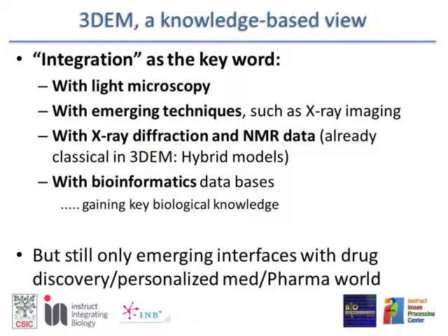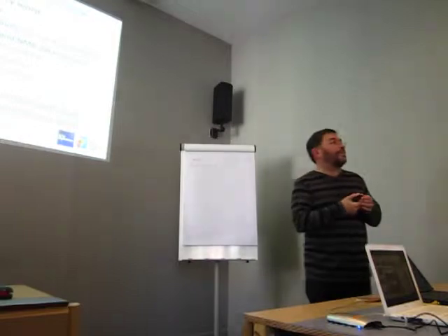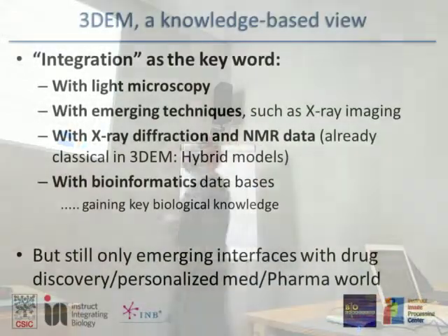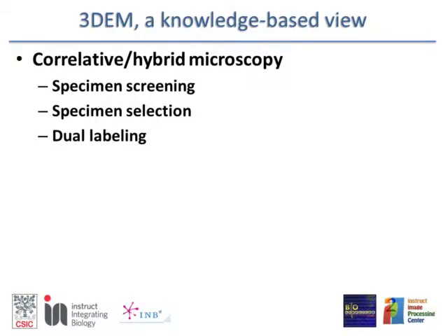So this is from the technological point of view, to tell you how good a choice you have made coming here. But it's not only from the technological point of view, it is that electron microscopy is fantastic at this moment to be a hub of information. Information coming from many different sources. I was telling you, our dear colleagues of cellular biology, who have done so much with the confocal microscope, with the tagging of molecules, have revolutionized our way to see the world. Okay, electron microscopy indeed is getting integrated into light microscopy.